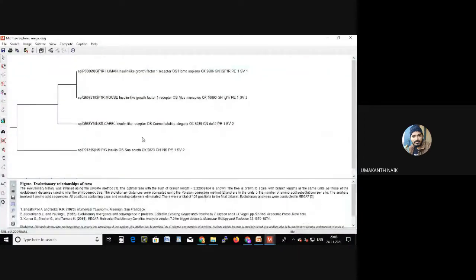After you are executing, you are going to find the difference, how far they are similar. And if you want the tree representation in a different method, go for selection here. So you can also select this method. If you want a rectangular method, you can select rectangle. If you want the straight method or curve method, you can also select. You can see the curve method here.